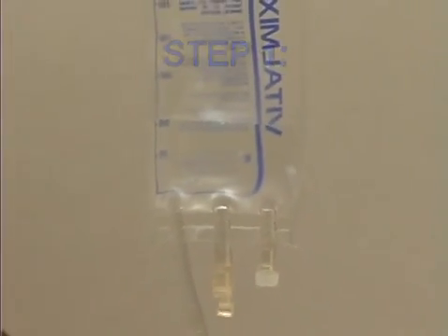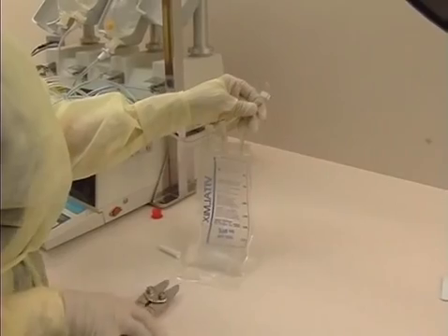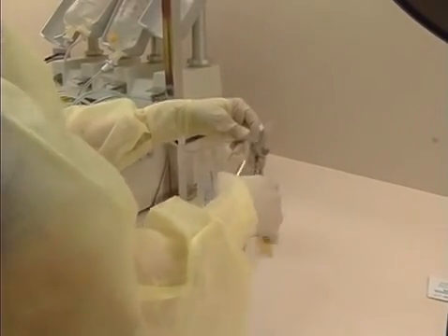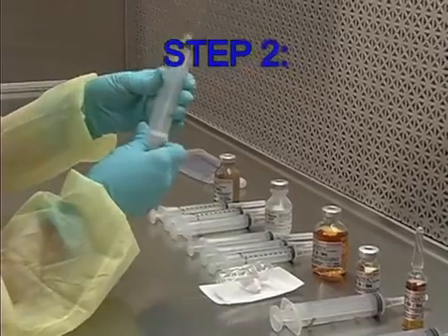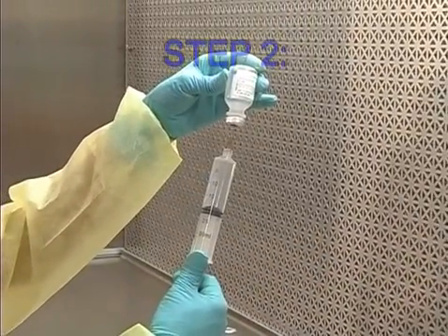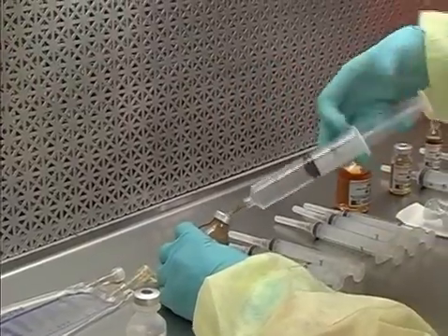Step 1: If a compounder is to be used in the validation, transfer 50 ml of sterile water for injection into the final container. For operation without a compounder, use the method you would normally incorporate for transferring large volumes when compounding TPNs, usually a liter bag and a Y-set. Step 2: Using the 30-ml syringe, draw up 20 ml of sterile water for injection from the staged vials and reconstitute the VM-20R.